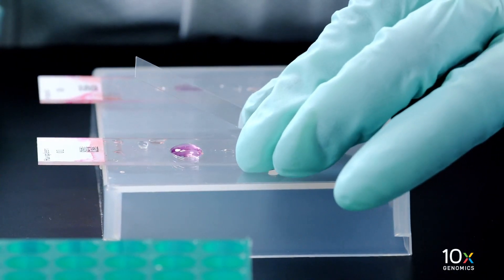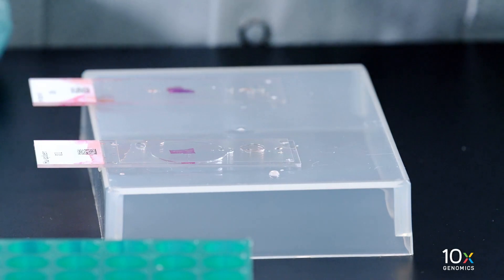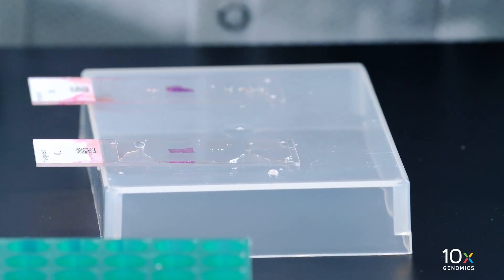Apply the cover slip at an angle on one end of the slide. Slowly lower the cover slip without introducing bubbles. Allow the mounting medium to spread and settle.